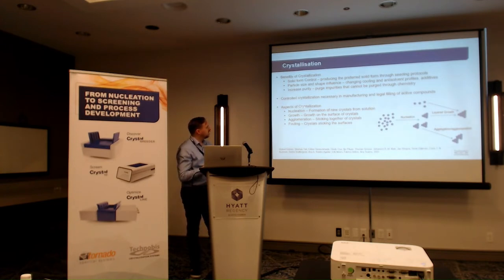So crystallization is actually made up of several aspects. Nucleation, which is the formation of crystals from solution. Growth, so this is growth on the existing nuclei surfaces, different particles. Agglomeration, so this is the sticking of particles together. And then fouling, which is similar to agglomeration, where you stick to surfaces, and these can be impellers, glass walls, the vessel, stuff like that.